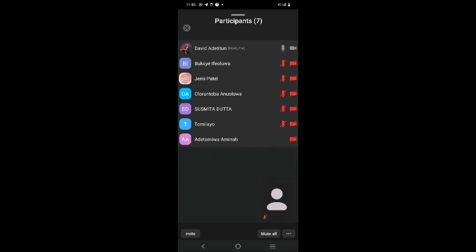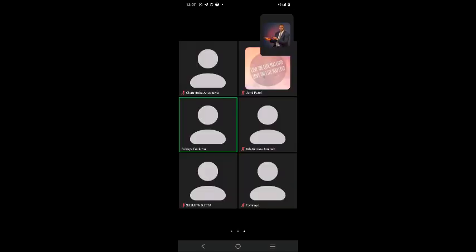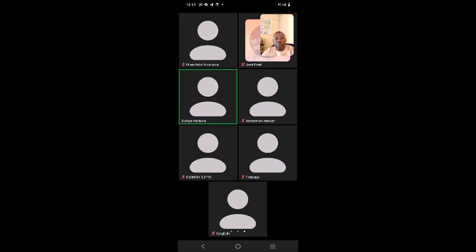Then we have the chemical method of sterilization. This involves the use of gaseous sterilant as well as liquid sterilant. In the case of gaseous sterilant, we have ethylene oxide, which is known as ETO, and this one is very effective for materials that are heat sensitive, and it has a wide spectrum. That is, it can terminate or wipe out many microbes.